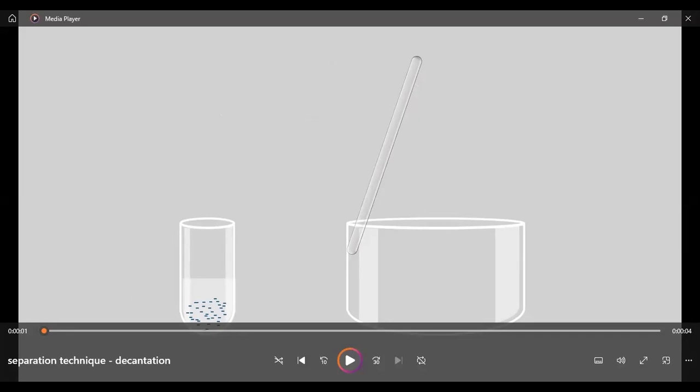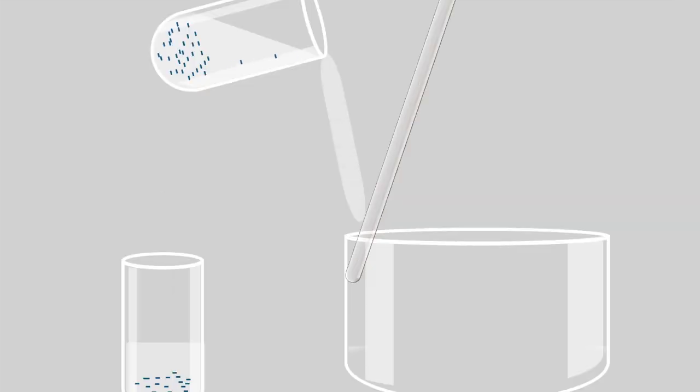The liquid will be on top of the test tube. The black particles inside represent the undissolved solid, while this upper part represents the liquid. Once they separate into two distinct layers, we can carefully pour the liquid layer out, leaving the solid particles behind.